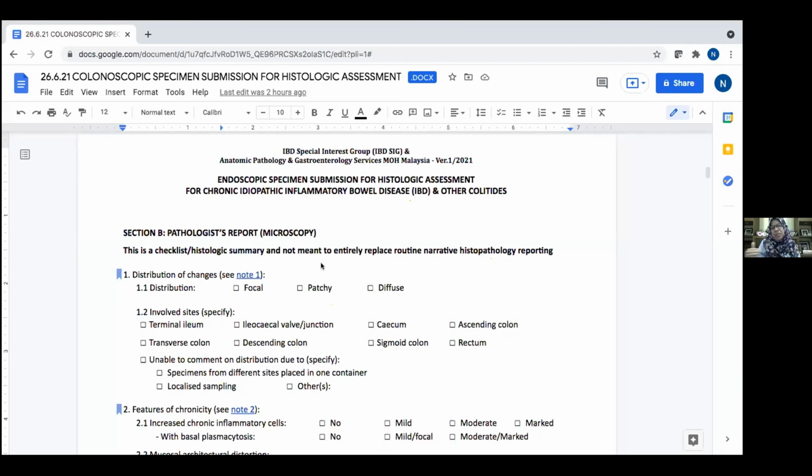You have sometimes 6 segments being biopsied, and you want to do 3 for all segments. It can be quite tedious to go through every level, but I would say 3 is kind of acceptable. 3 slides or few levels on one slide as a guide, I think.